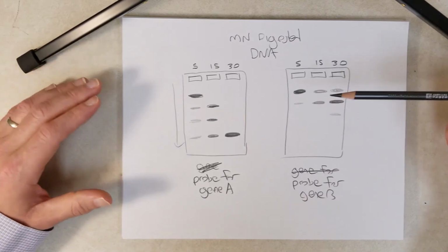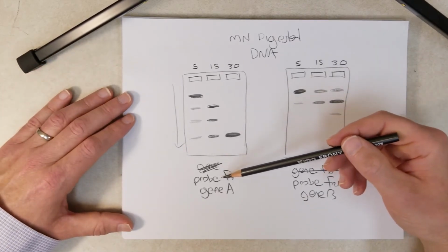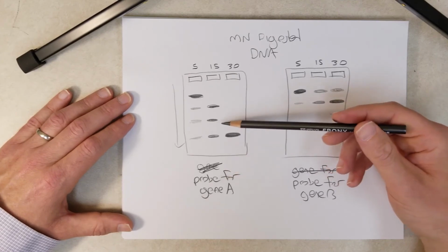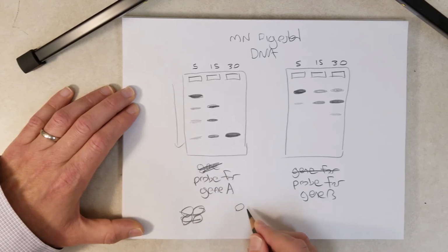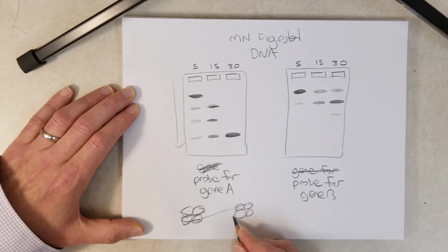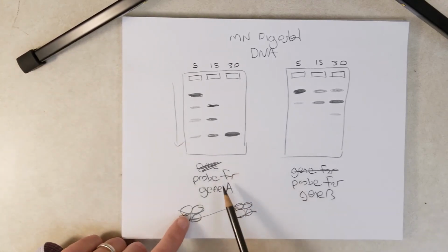Well, it looks like gene A is in a part of the genome that is associated with open chromatin. Micrococcal nuclease was able to get at all the linker DNA between the nucleosomes because the chromatin for gene A was in an open conformation.